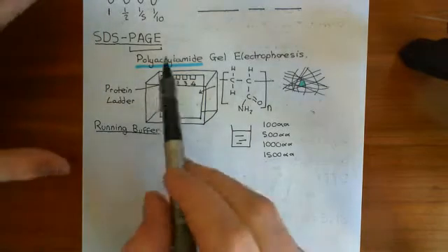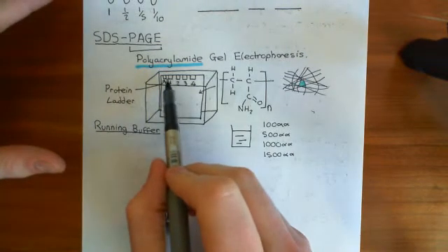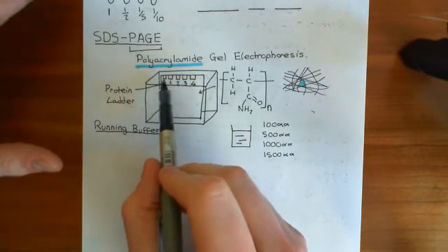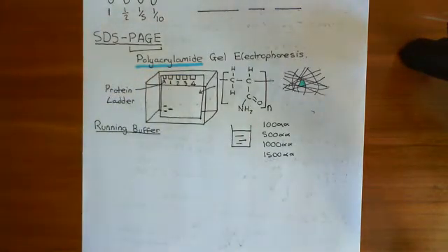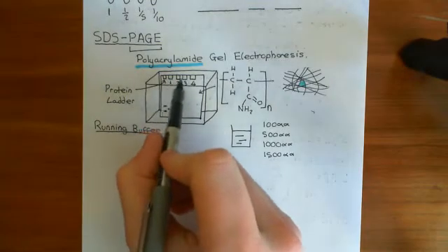So we have loaded our samples - sample 1, sample 2, sample 3, sample 4, and our protein ladder into wells. You'll just take a micropipette and add your 20 microliters into each one of these wells.